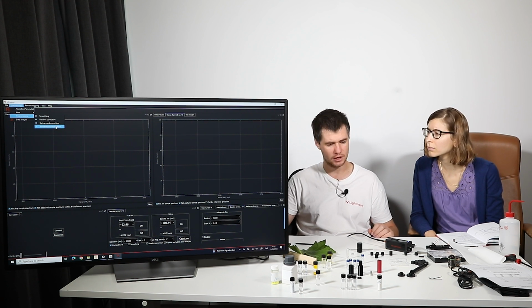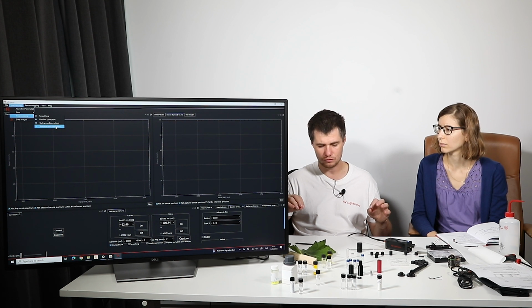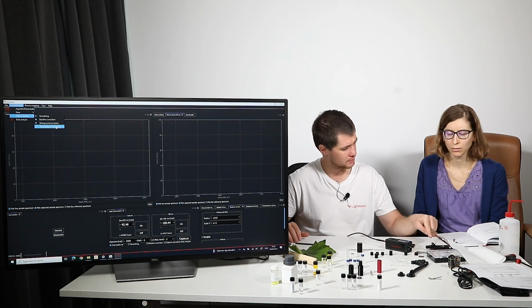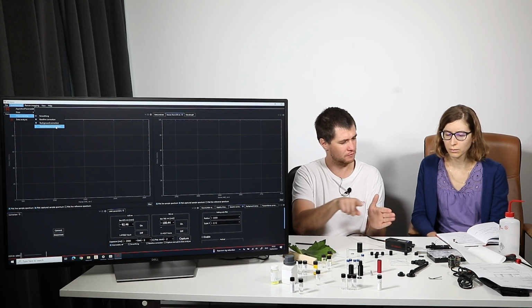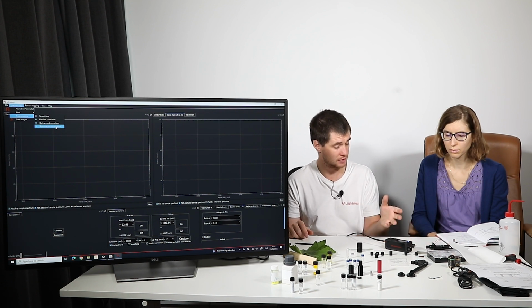And transmission correction. This transmission correction you need if you want to compensate for different transmission of your Raman filters inside, and grating, dispersion, sensitivity for every wavelength, and basically all of the optical elements and even the sensor.